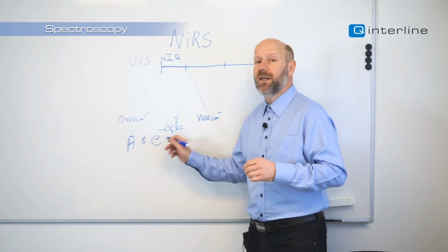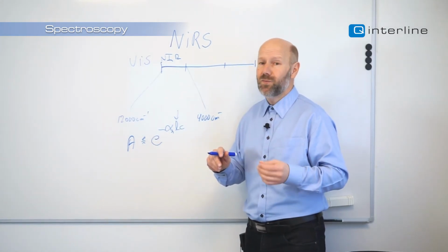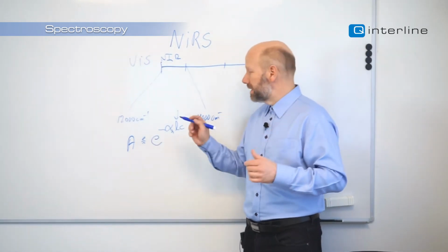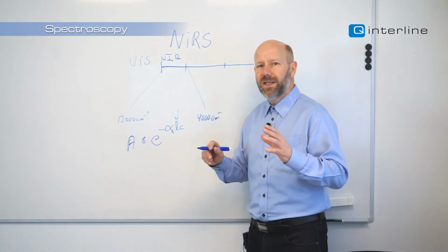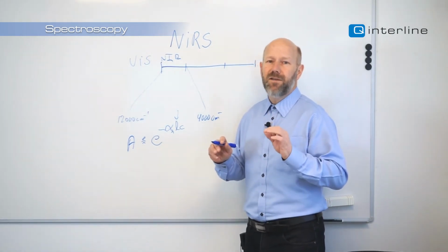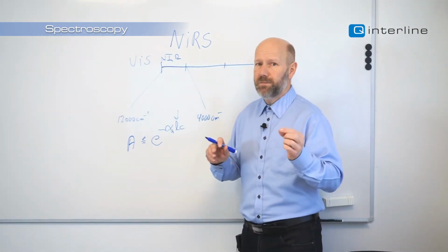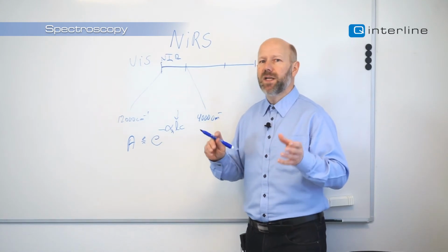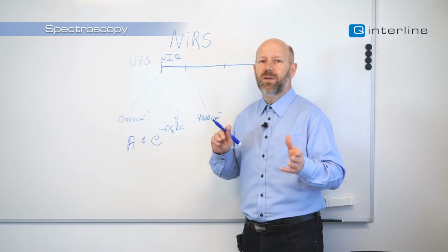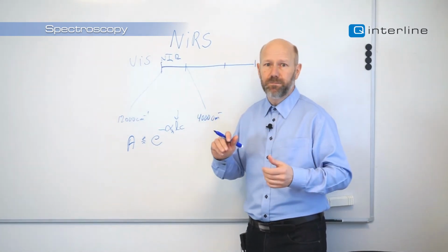Another thing which is very elegant with NIR is that water doesn't absorb as much as in the mid-infrared where it absorbs a lot. And to get a feeling for these L things, the mid-infrared is typically dealing with layers of 5, 10, 20, 30, 40 microns, but then it's very thin. So it's not very practical, but you get beautiful spectra. The near-infrared means we are working with millimeter or centimeter path, much more practical.